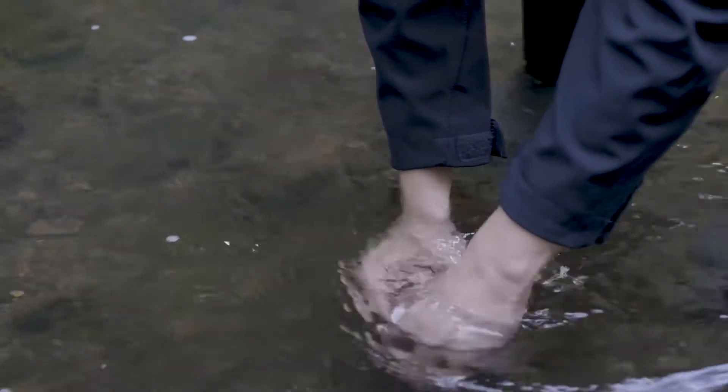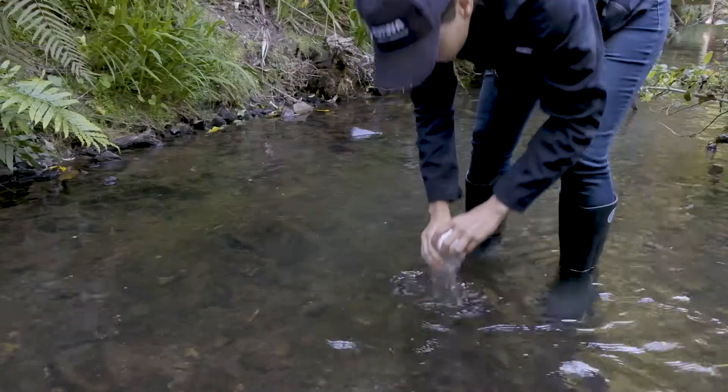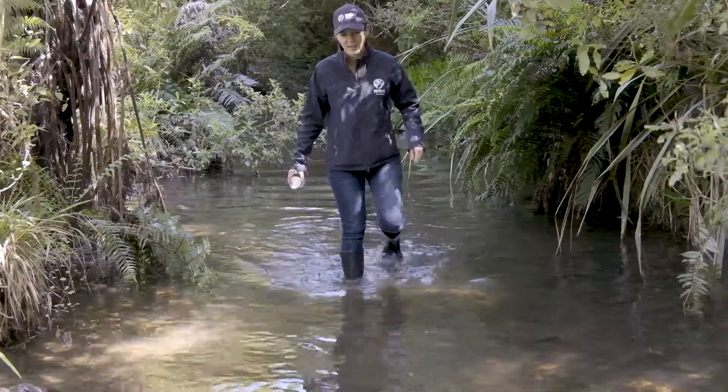Take the sample close to the surface. Put the lid on while the container is still under water.